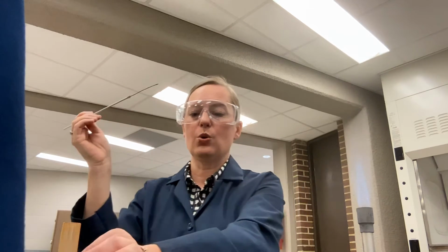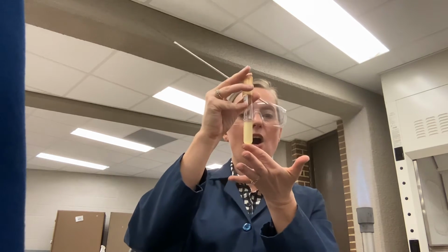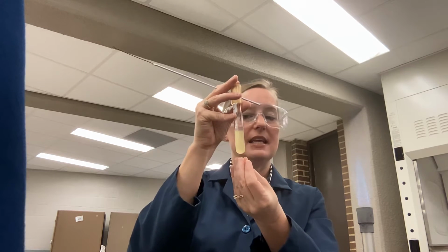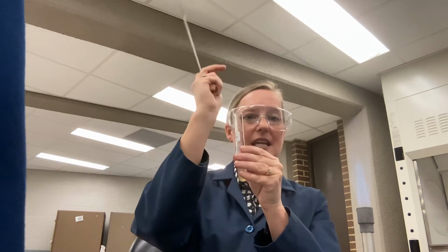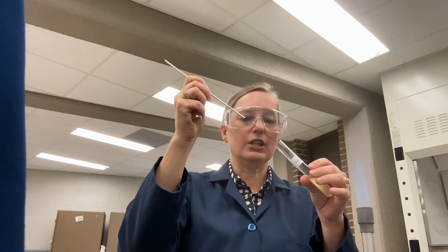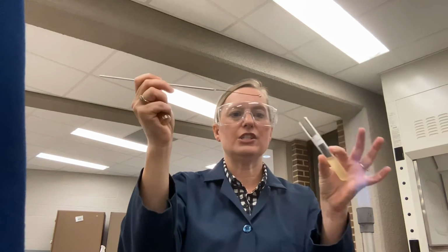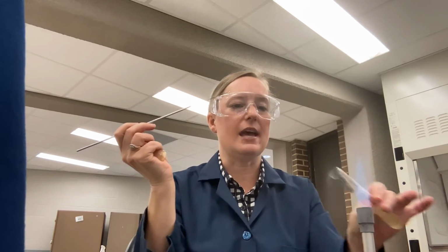So the loop is now cool. We're going to take our test tube, and again, we have a broth, so it's a liquid, and I often very gently shake it up initially to get all of the sediment at the bottom uniformly distributed. What you're going to notice is the cap is going to stay in my hand by my pinky. We're going to pass the top of the test tube through the flame, and we're going to go in with our loop and get 1 loop and go all the way to the bottom. 1 loop of bacteria, because there's a little bubble of bacteria, and then pass this through the flame again. So we pass it through the flame before and after.